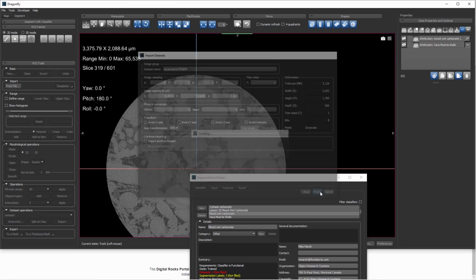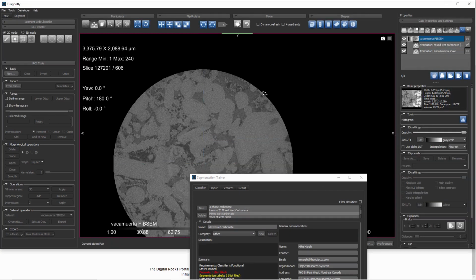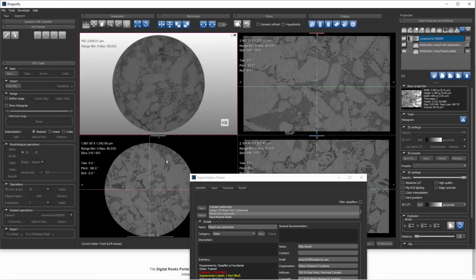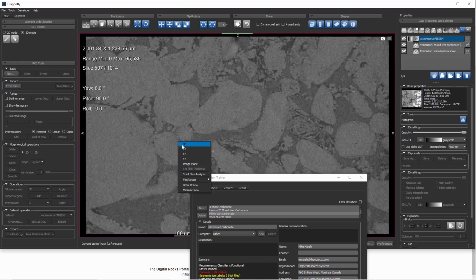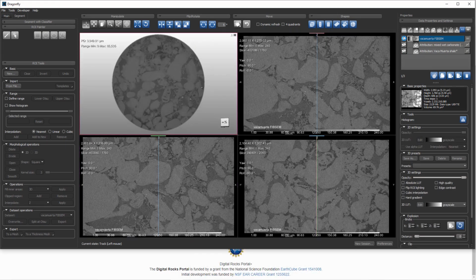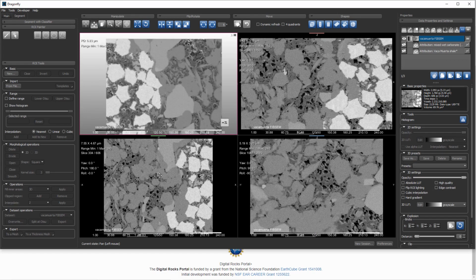All right, so that data set is, what did it say, a couple of gigabytes, so we'll go ahead and let that data load. All right, I am having a refresh error, so let's see if I'm going to right click, and I'm going to double click. That data set is not in my workspace anymore, but there's a bug that's causing it to still be refreshed. What if I go here and choose a different view? I'll close this out and go back, and we'll turn this data set on and refresh. Let's see if that does it for us.